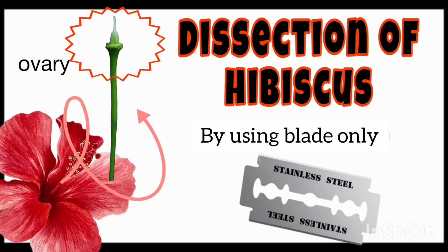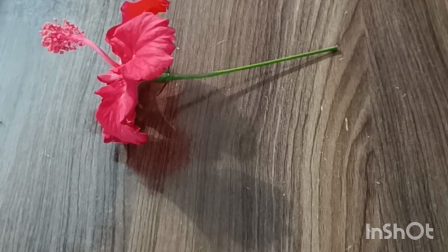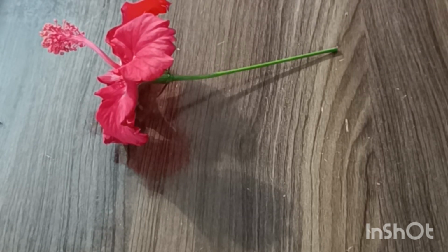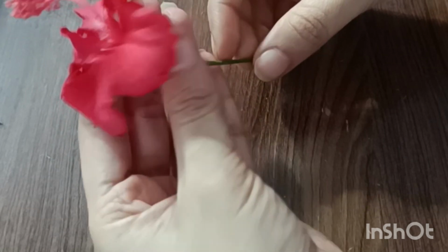Hello everyone. Today I am going to perform the dissection of a hibiscus flower to study its different floral parts. For this dissection, I need a fresh hibiscus flower and a blade or needle. First, I observe the external features of the flower.